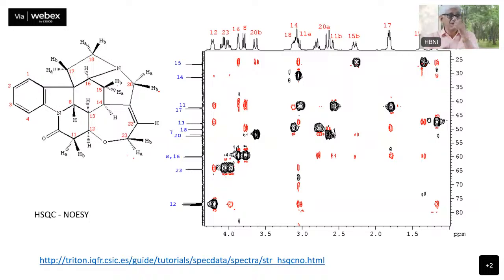Because the quantification of the NOE is not going to be so precise, when you have a large number of NOEs, you can actually calculate the structure to be consistent with the approximate variations in the intensities. So when the intensities are similar, it will mean that they have similar distances. That will allow you to calculate the structure.